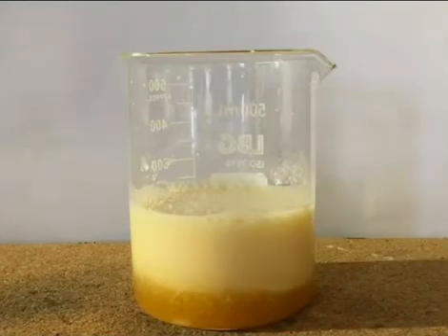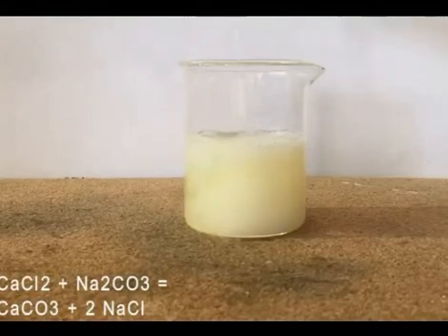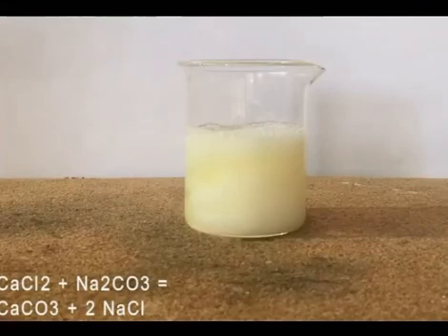I chose to use sodium carbonate to do it, but sulfuric or oxalic acid can be used instead. The carbonate is just easier to convert to other calcium salts. As you can see, a white precipitate has formed.